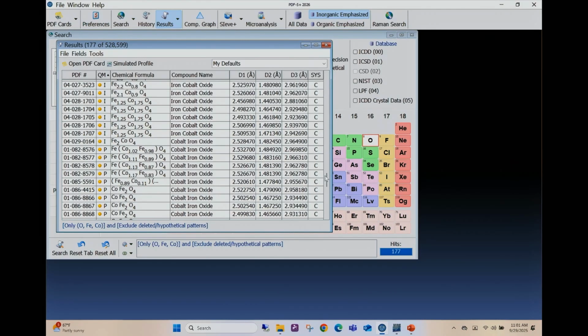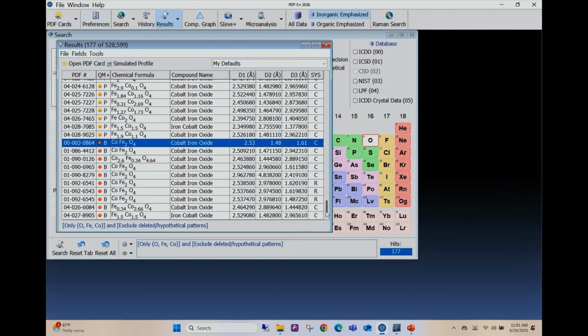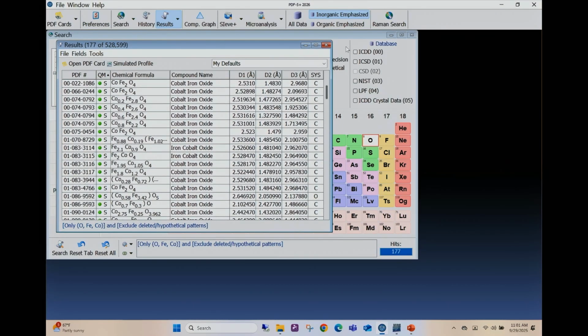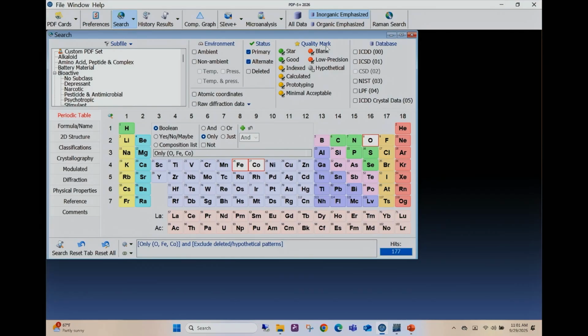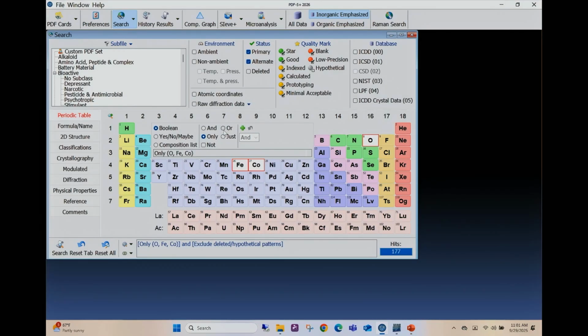Caution. Red means pause a second and let's make sure we know we're okay with that entry. All right? Okay. So I'm going to close this again and just show a couple of the other operators here. If I said "or," the number's going to go up again, because what I'm saying here now is it only needs to have one of these elements.